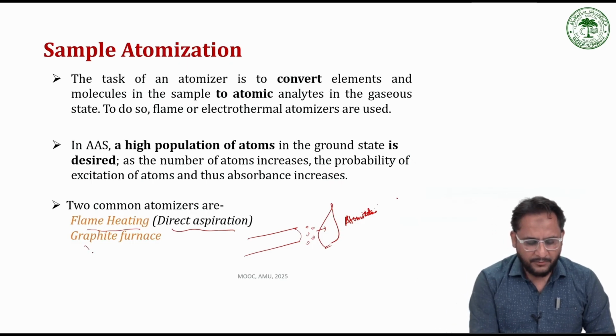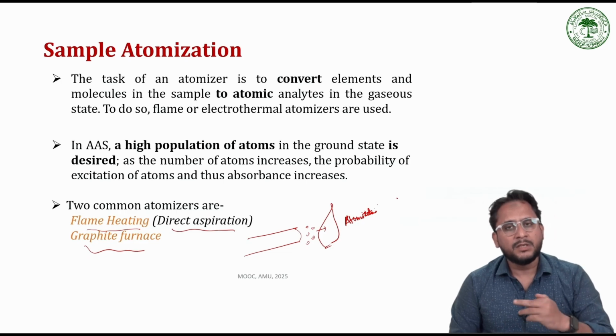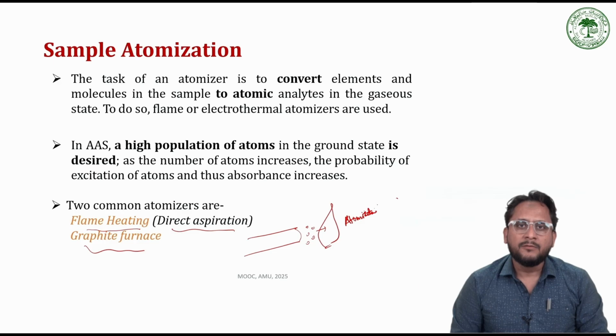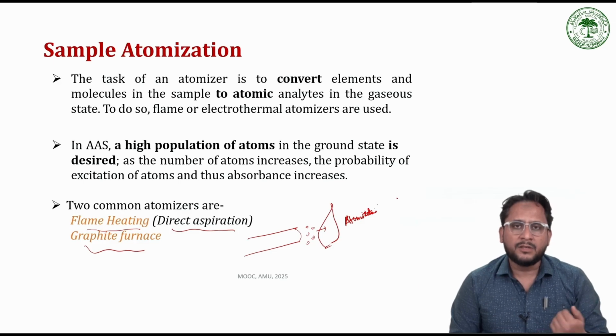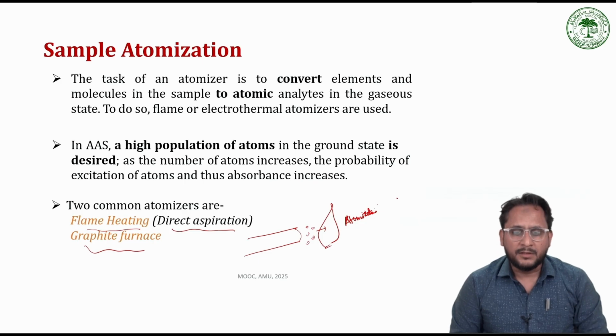And we also have graphite furnace. They are electrothermal units which use electrical discharge to convert the sample from aerosol to vaporized atoms, vaporized individual atoms.